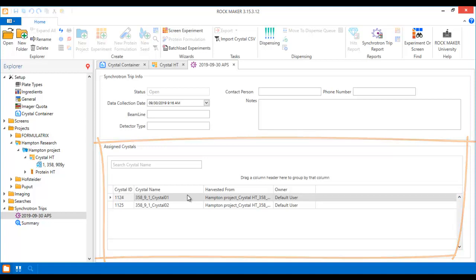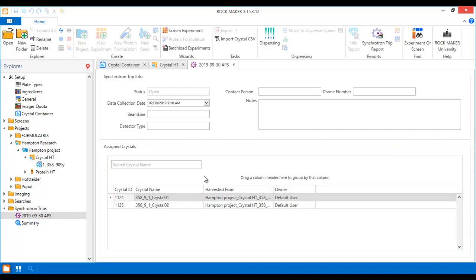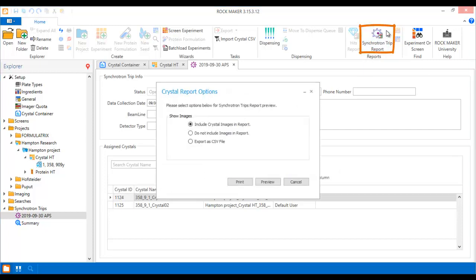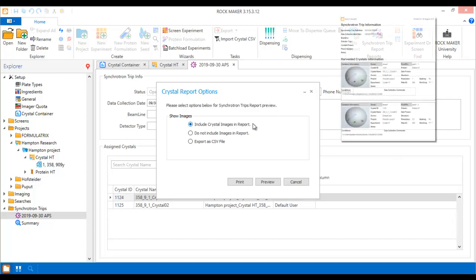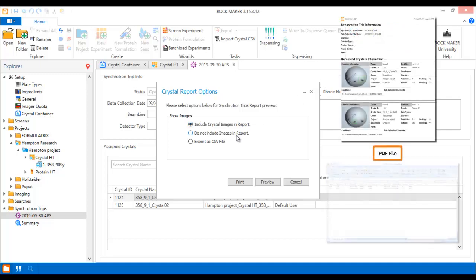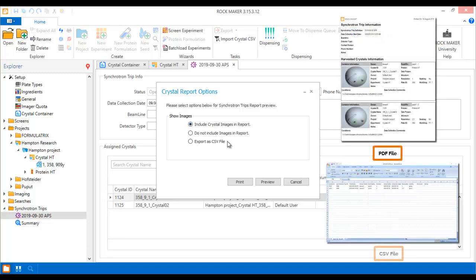One of the most powerful tools in RockMaker to help you manage your synchrotron trips is a synchrotron trip report. You can save the report at any point during your trip management process as either a PDF or as an editable CSV file.